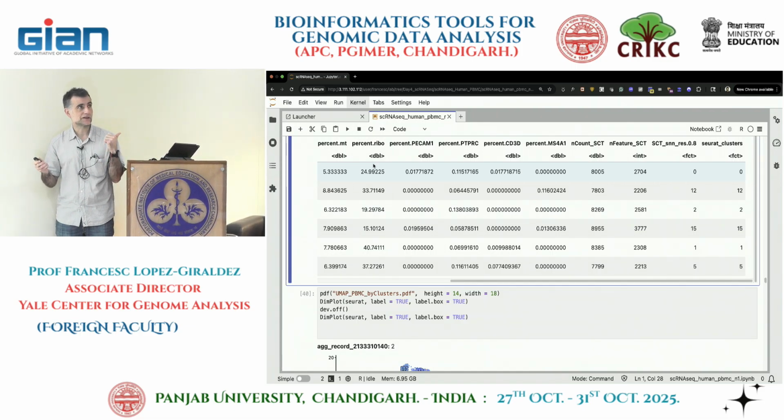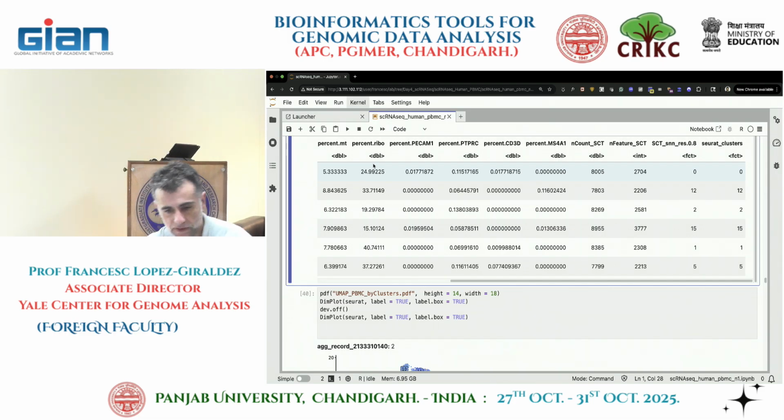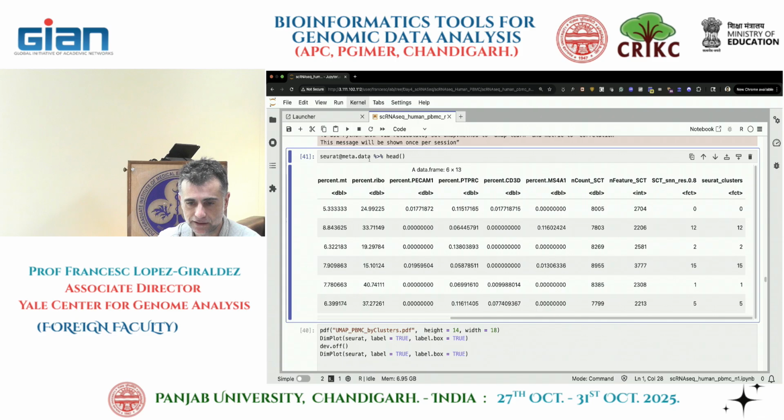The cell stopped having the original identity we call PBMC something. Now the active identity changed to be seurat_clusters, which is this information here. So the first cell in our metadata belongs to cluster 0. These two are identical, and I'll come back to that later. But I don't think, if you do glimpse, I'm not sure if it's explicit.